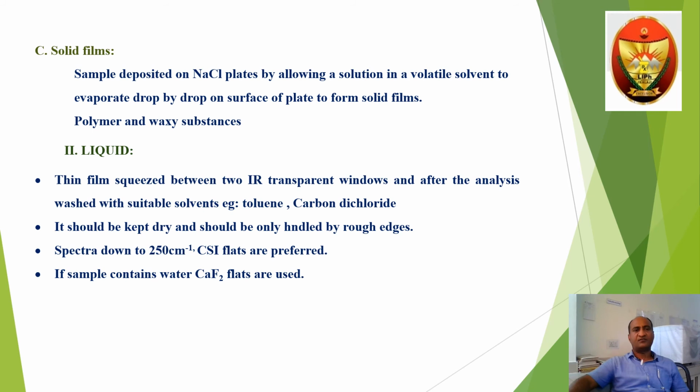Another technique for solid samples is by making solid films. For that, we deposit the sample with a volatile solvent on a NaCl plate and allow the volatile solvent to evaporate, so that there is a formation of a solid film, and that can be kept in the instrument and we analyze it. It is generally preferred for polymers and waxy substances.